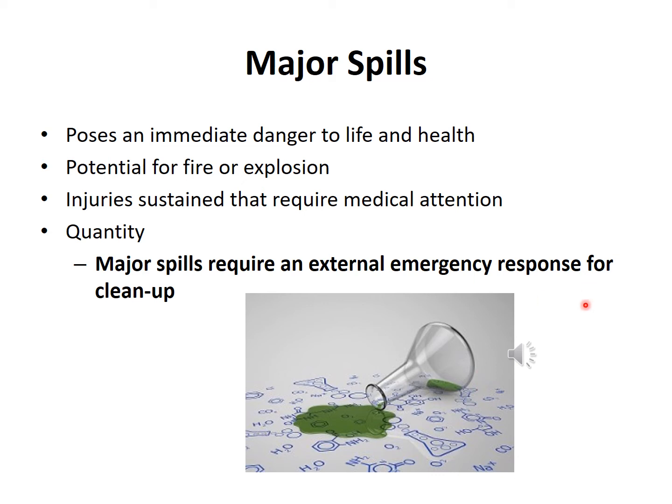For a major spillage, it is really important to inform the technicians or the lab supervisors, and there needs to be an emergency response. So definitely you have to contact the concerned people. So how to handle major spills?